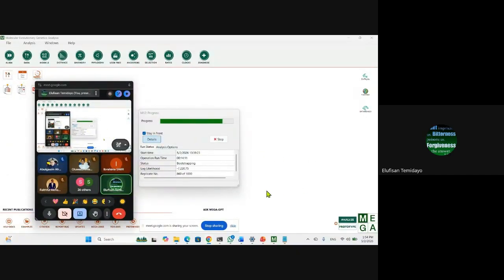Let this finish, then we can look at what it is, how they look like. Then I can entertain some questions that you have for me. Like I said, I don't think the time allotted to me for this will be enough. And this is almost 2 o'clock already. I don't know what time it is in that place, maybe 8 o'clock already or 7 o'clock. So that's why I said for those three things, the time may not be enough for me to be able to explain. So let's see what this is doing.